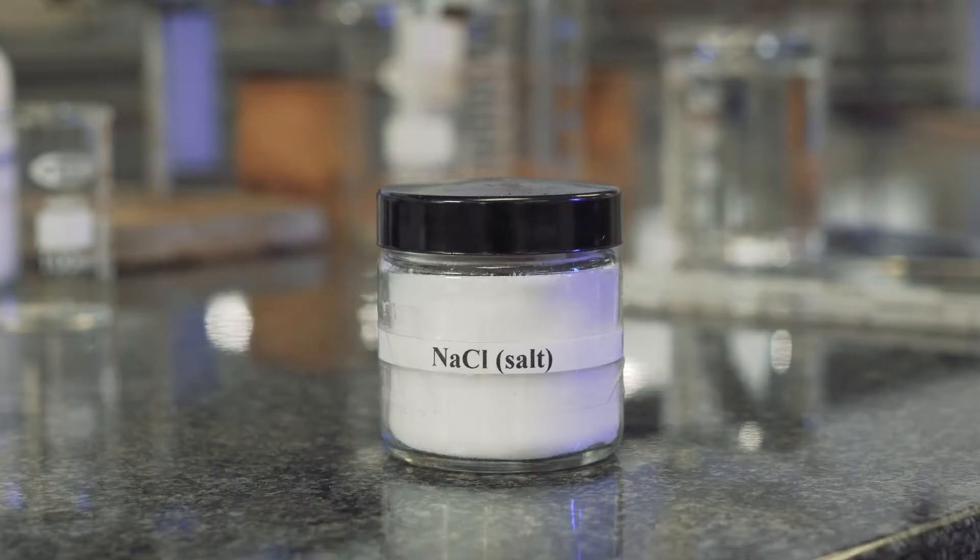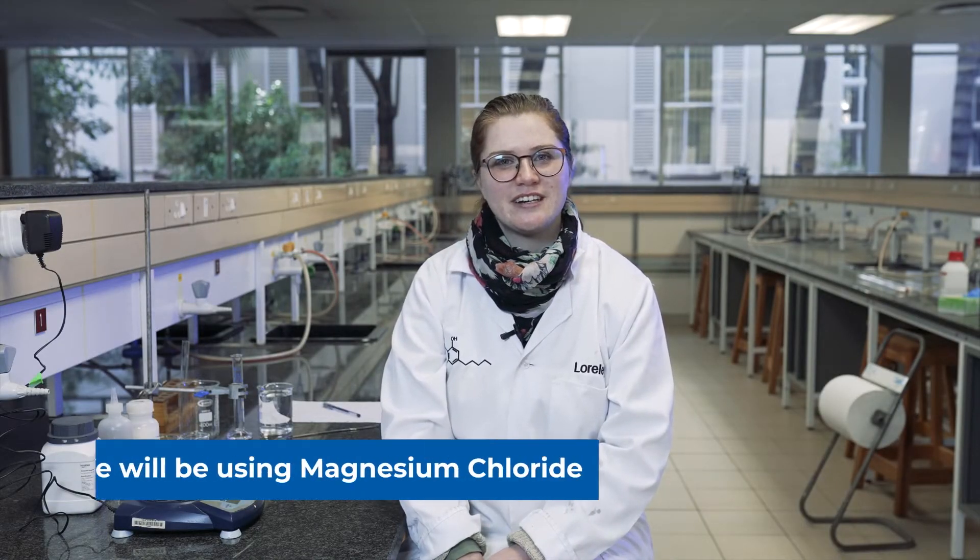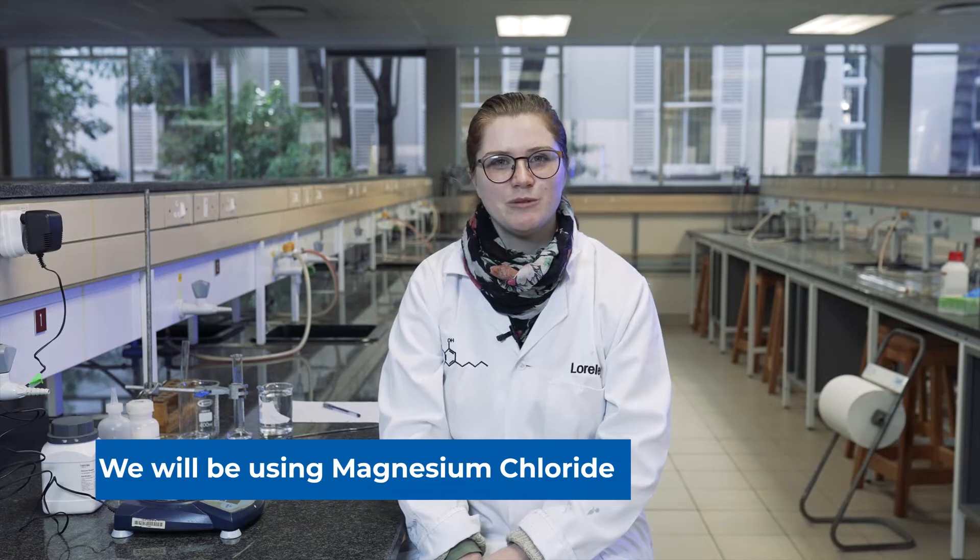Good day students, I'm Laura Lee Cairns and today I'm going to take you through the colligative properties experiment. We're going to start off by weighing our different masses of sucrose, sodium chloride, magnesium chloride, and glycerol, and thereafter I'm going to show you the freezing of one of our test tubes so that you can do your report sheet.